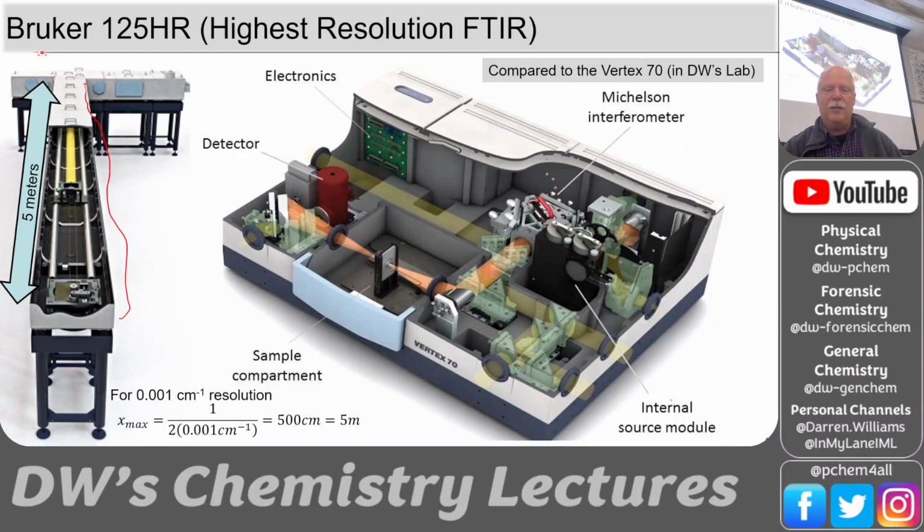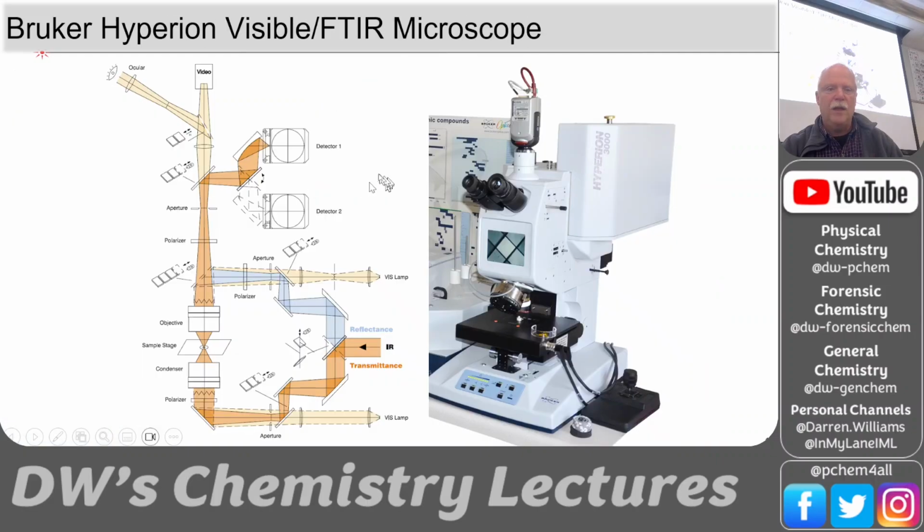This is the spectrometer we use in my lab. It's got the source here. Here's the interferometer. Then the light goes through the sample, and then it is reflected onto the detector. So those are your main parts. We can hook this thing up to a microscope and do microspectrophotometry.